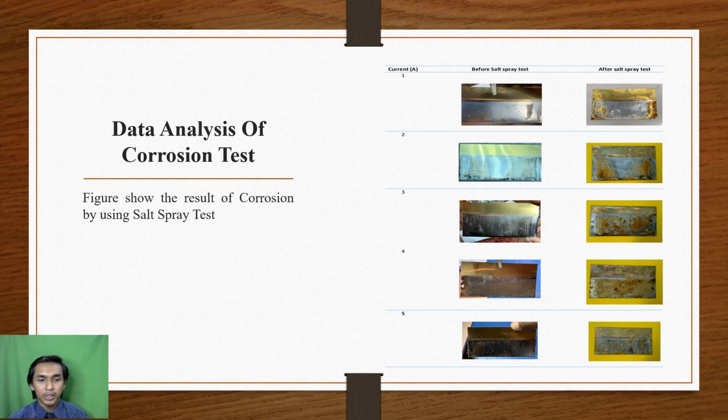Also, the position of the specimen must be right because based on the previous study, the specimen should face upward when put into the machine during the spray process, so the specimen can produce a good result when we put it in the right position.